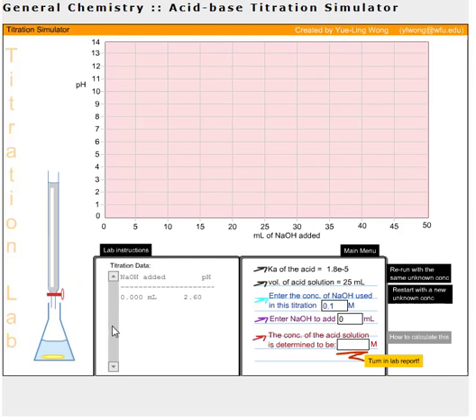Here you have where your titrant added will be tabulated along with the corresponding pH at that time. And then over here in this area is where you can change some of those settings indicated in the instructions. In the blue area here, it says to enter the concentration of sodium hydroxide used in this titration.